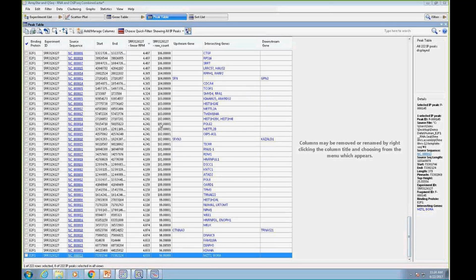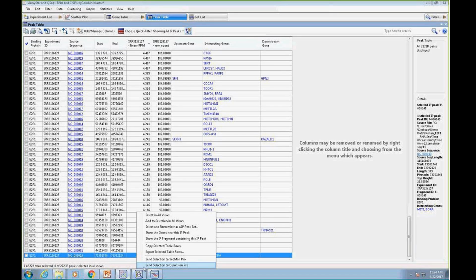And the threshold, you can see I've got a linear RPM value and a raw count. It's about 100 reads. My weakest peak has about 100 reads aligned to it. You might set a different threshold. I might just take everything that's here, but again, a sanity check now is, let's see what a peak looks like at this lower end of the range.